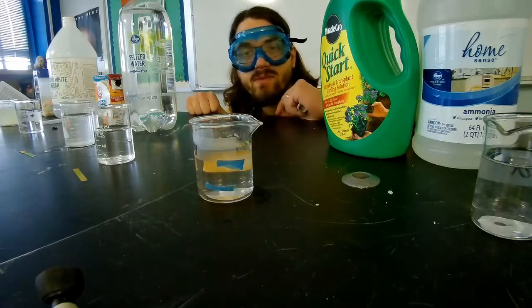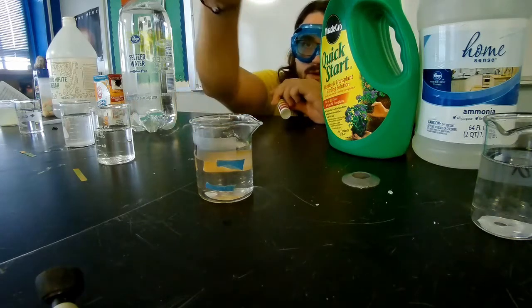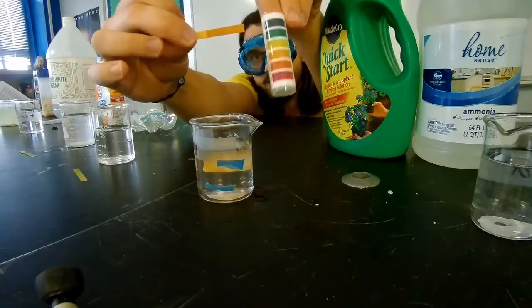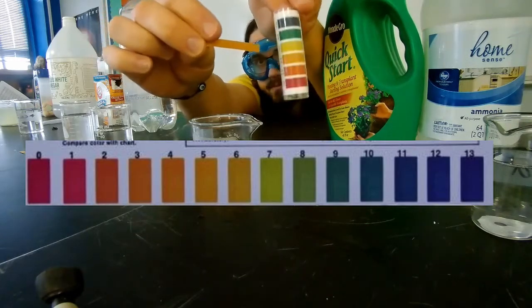Alright, let's see what happens with our next one. This is our fertilizer. Is it going to be an acid or a base? I'll let you be the judge. What's the pH? Is it an acid or a base?